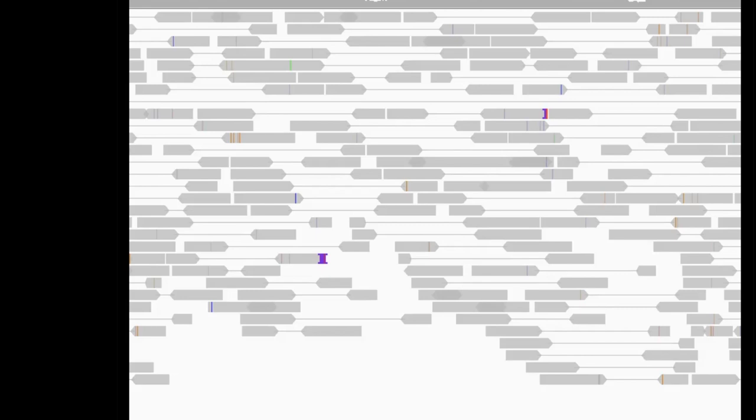This is how a SAM file looks when you visualize it — this is from IGV. You can see paired-end reads where the forward and reverse reads are linked by a small line representing the unsequenced part of the fragment, all aligned to the reference genome. You also see colors indicating mismatches between the read and the reference genome. All that information — where it aligns, where the mismatches are — is stored in the SAM file.